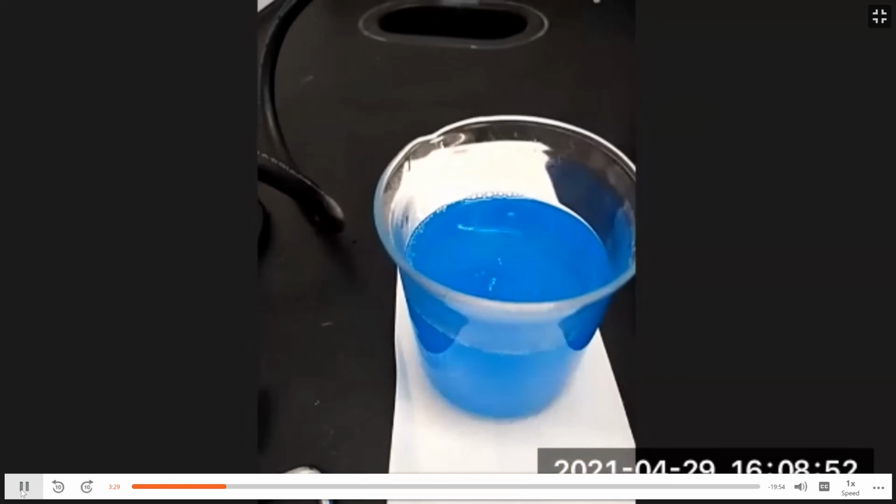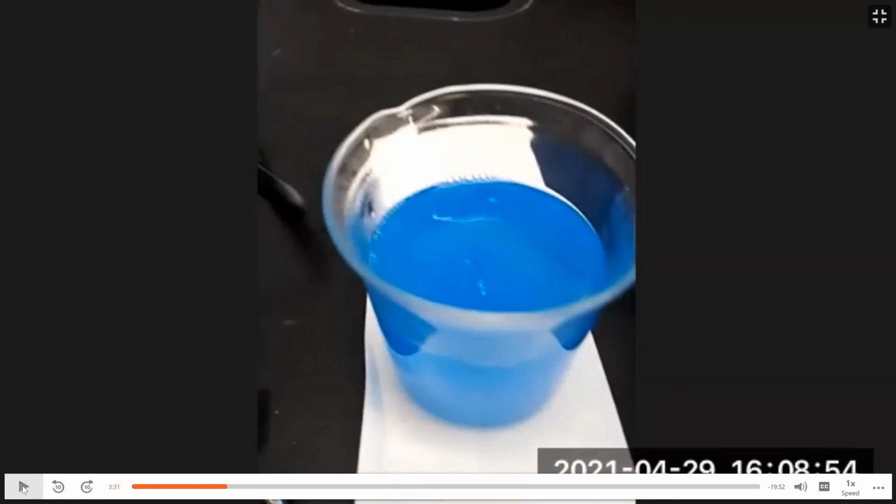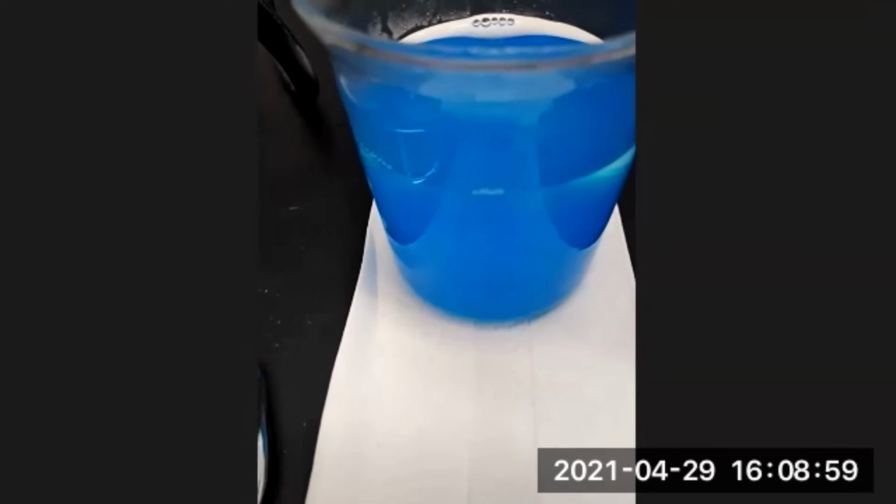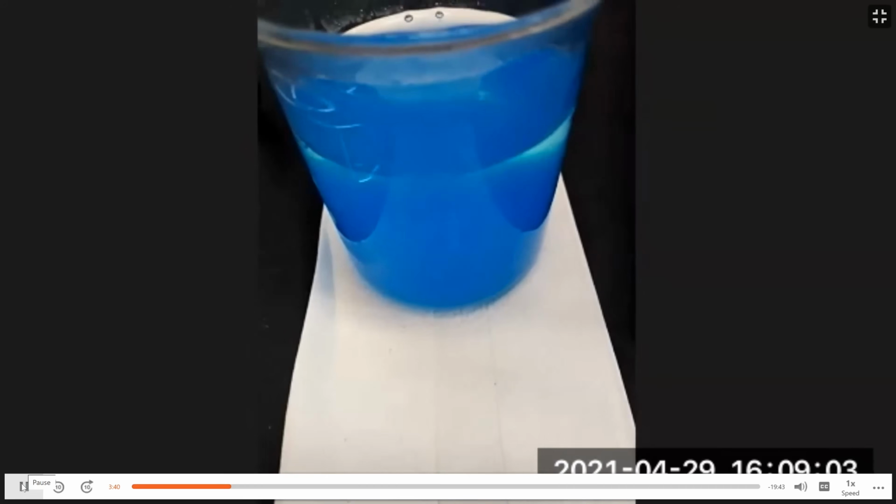Let me go back a little bit so you can see that again. So be watching here. We're going to add the aqueous sodium hydroxide, and you're going to see a dark blue precipitate form. So this is the precipitation reaction between sodium hydroxide and copper ions. So we'll leave this for a few minutes to react, and then the next step would be to heat it so that we can do the third step.